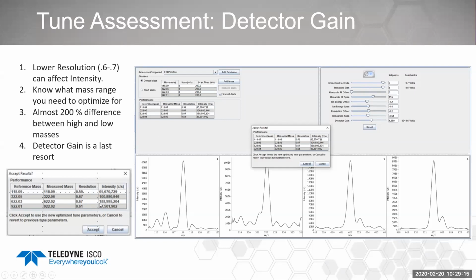So we've switched our bias drastically towards the higher end, to the 600 to 900 mass range. And it'll help you be able to get your material off and have a higher sensitivity, higher response factor for them.